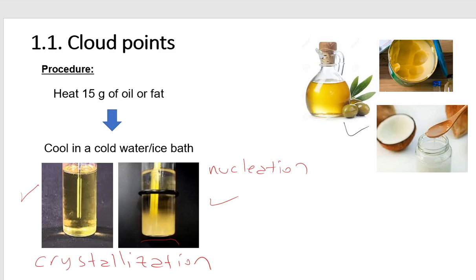And during crystallization, triacylglycerols can pack in different forms depending on the lipid type. So cloud point is the temperature at which crystallization starts. Therefore, the cloud point is related to the packing of triacylglycerols within lipid crystals. And packing relates to, remember, chain length, and also chain type.